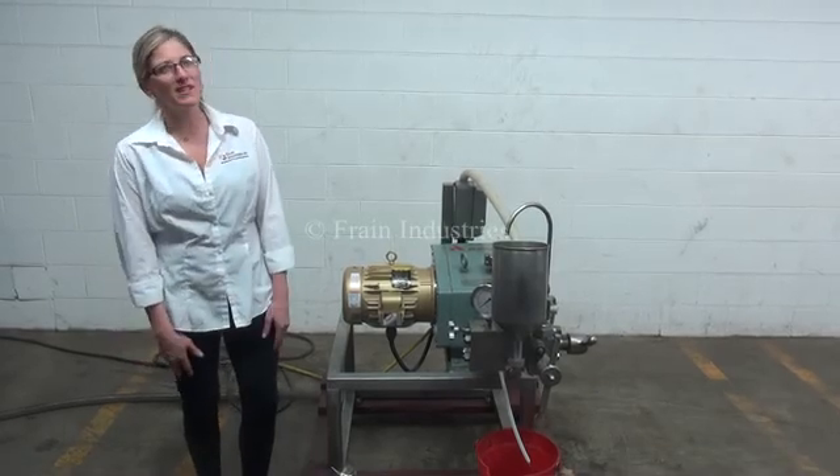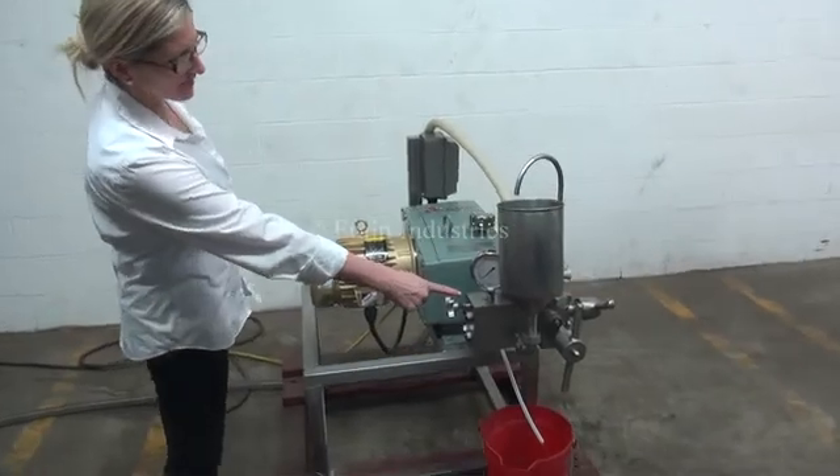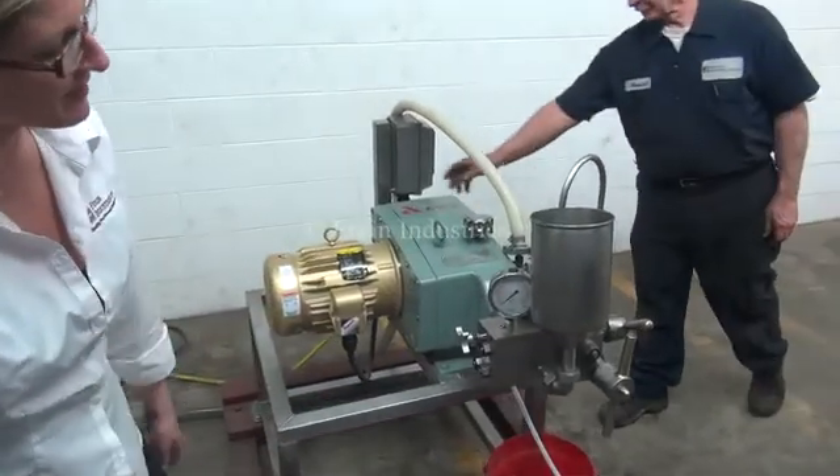To demonstrate the situation that you'll be using the homogenizer in, we'll first be using this lever to bring the product up to 500 psi.